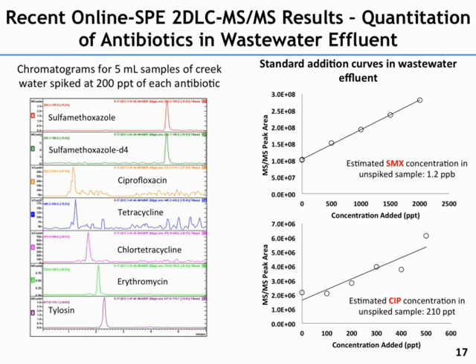And some of these compounds, the Cipro and tetracycline here, we've had trouble with. These chromatograms don't look as good as in the 1D case, but this was primarily a problem of drift with our detector, loss of sensitivity, which we just figured out and solved in the last week. So we expect that those will look a little better in the future.